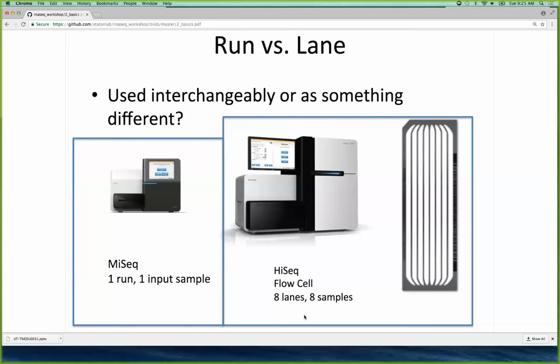And most sequencing facilities are fine. Only once have I been burned and gotten back bad reads. And occasionally you'll still have a library failure. Sometimes a library just goes kaput and you don't get anything. But for the most part, you can get within 20% variation of the number of reads per sample. So a little bit of variation, but not a ton.